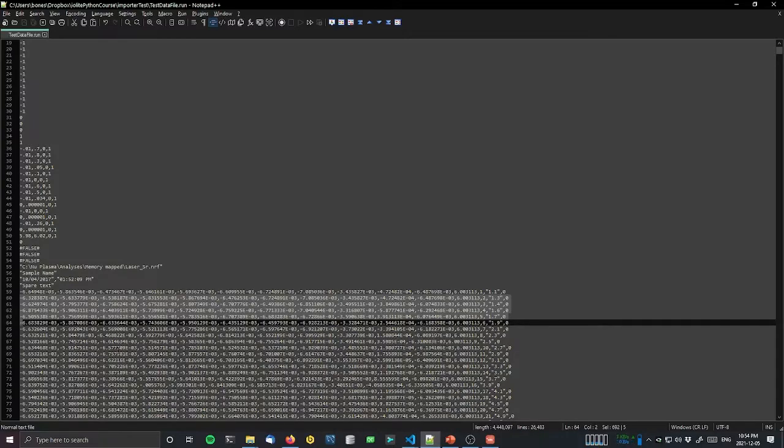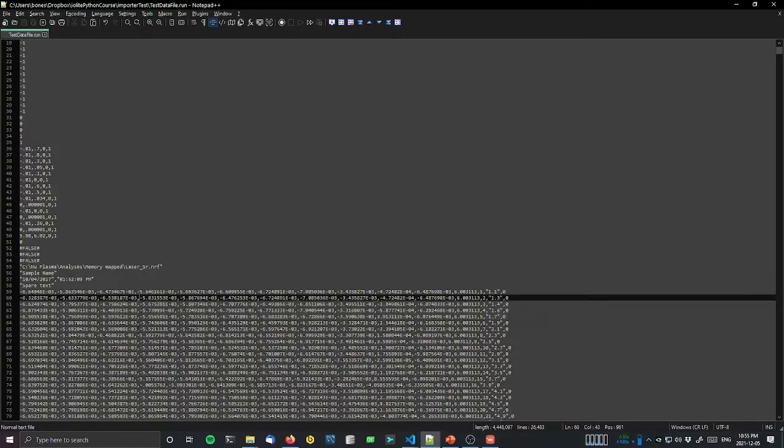If I was to load another file from this mass spectrometer that was looking at, for example, neodymium isotopes, I'd have to write another importer because I've hardwired the channel names. Unfortunately, that's just what has to happen with these particular files because we can't tell what the channels are called.